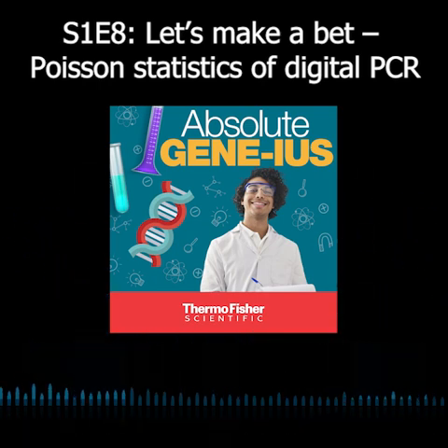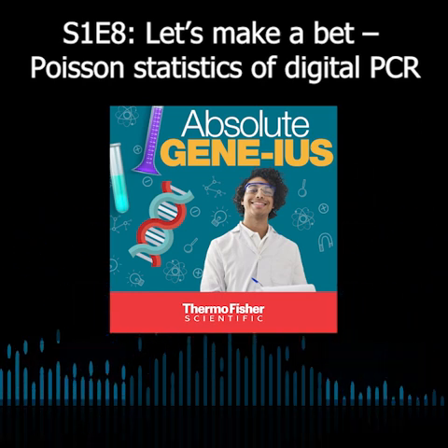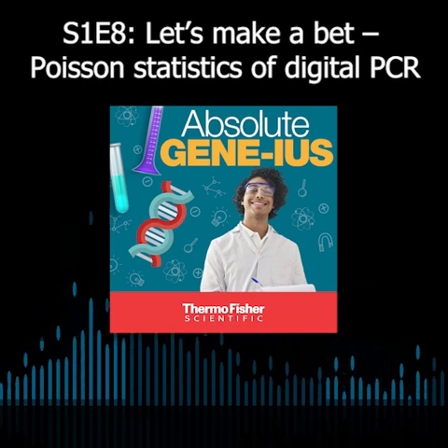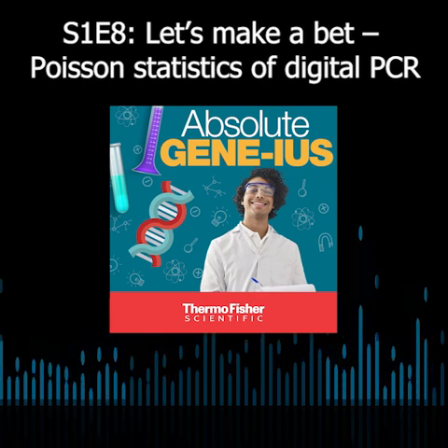Yeah, probably. 10%, sure. 1%, maybe not, because of that sea of background noise that you're getting. But with digital PCR, you can certainly get down to 1%, even less, 1/10%.